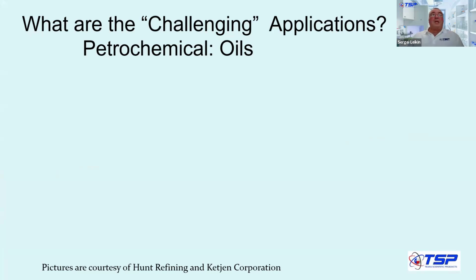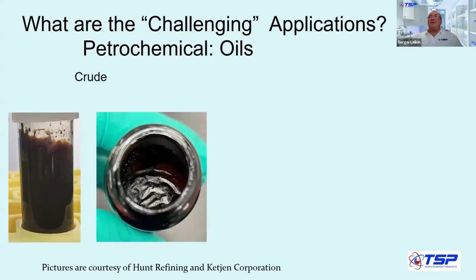The first challenging application is oils. There are different types of oils. If you are running lubricating oils, or maybe wear metals in used oils, it could be challenging. But the most challenging are some of these that you can see on the picture that was shared by some of our customers.